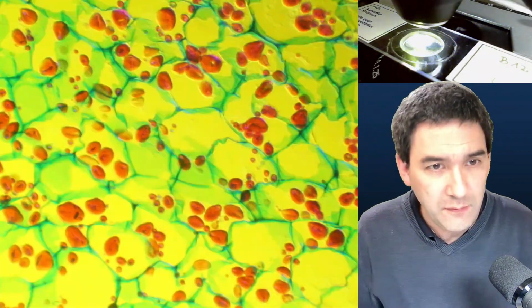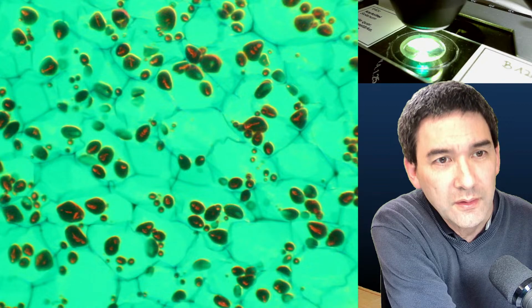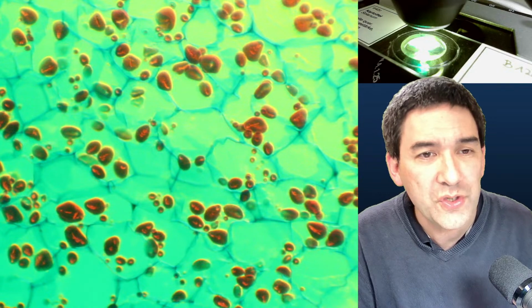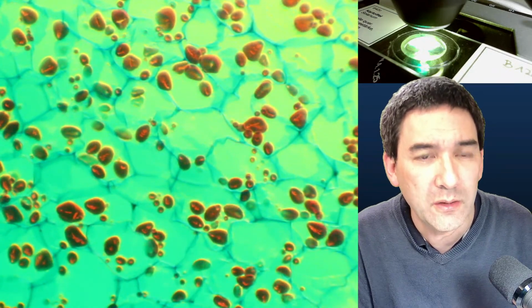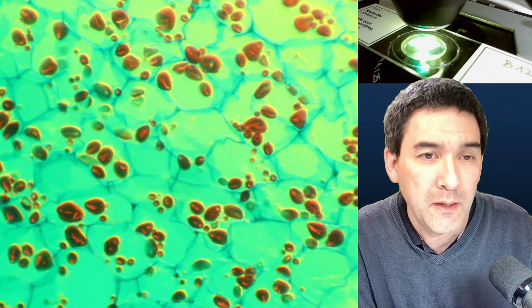Then if you were to use a green, let me use now a green-yellow one. Then it looks like this. If you open it a little bit, so of course you are getting some kind of a mix between the color filters, the Rheinberg filters, and the actual natural color of the specimen.